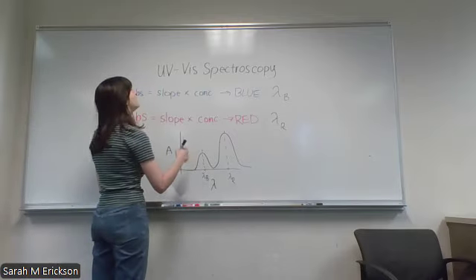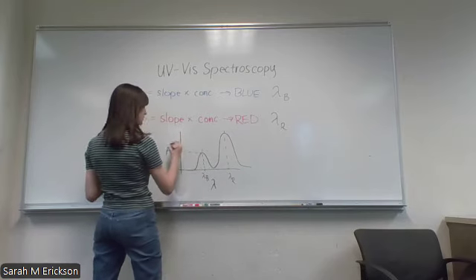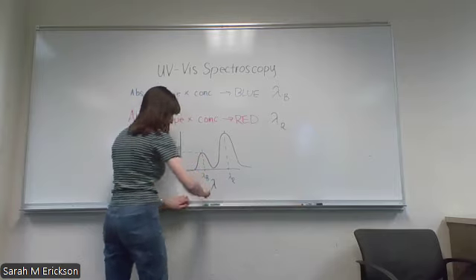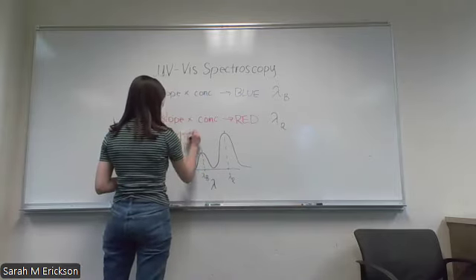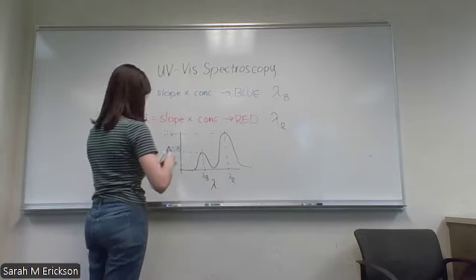What you want to plug into your calibration curve, maybe for your blue peak, you notice absorbance is like 0.25. And then maybe for your red peak, you notice that your absorbance is 0.6. I'm just making up numbers right now.